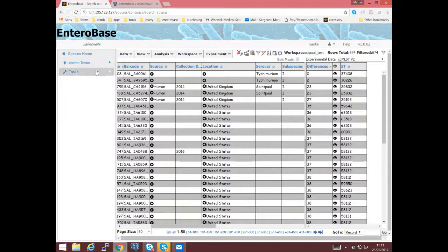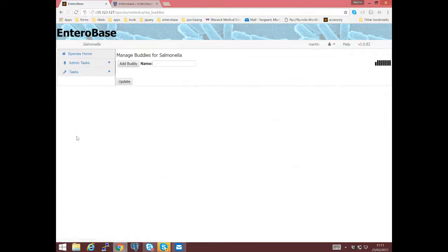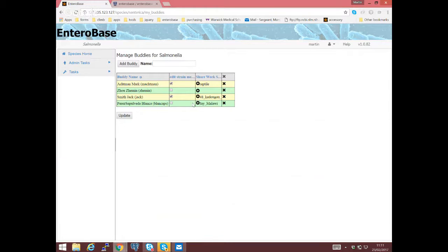So I think next on the agenda was buddies. I've created this workspace now, and I want to share it with a friend. So if you go to tasks and my buddies, you could start typing the name of the person you want.